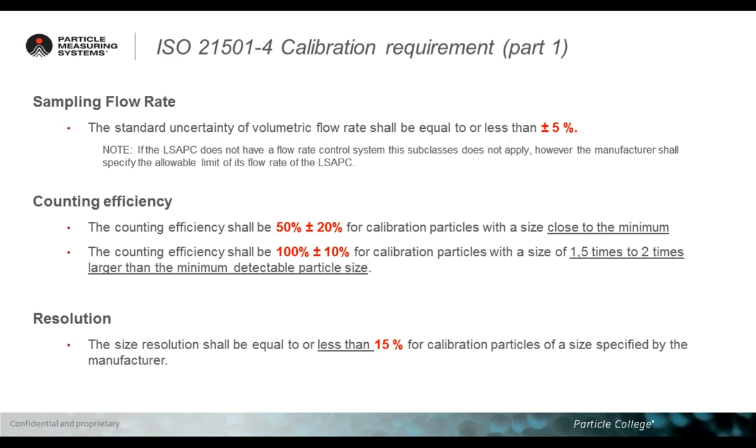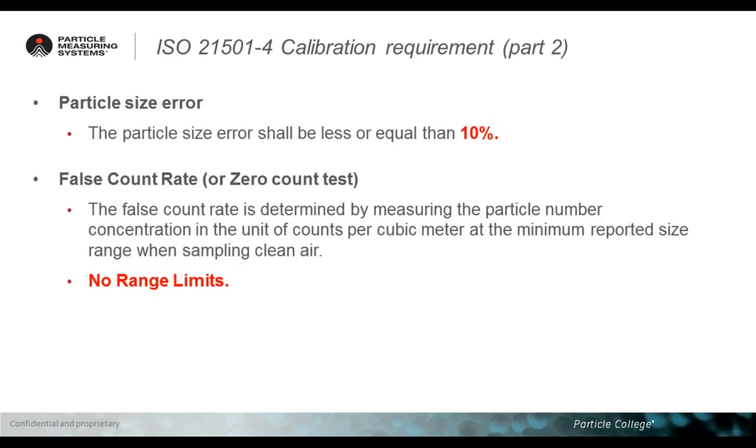Then we have the resolution requirement, and we will see shortly what the resolution is. Just for your information, 15% is the maximum allowed resolution, so lower is better in this case.